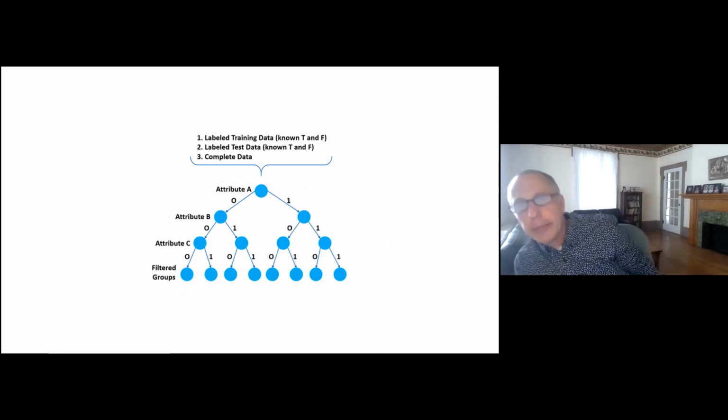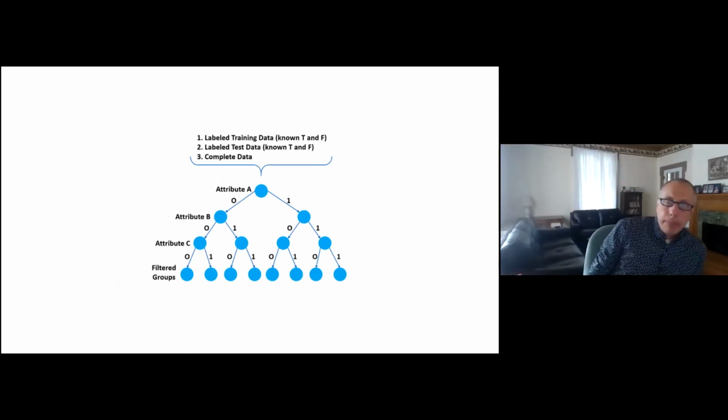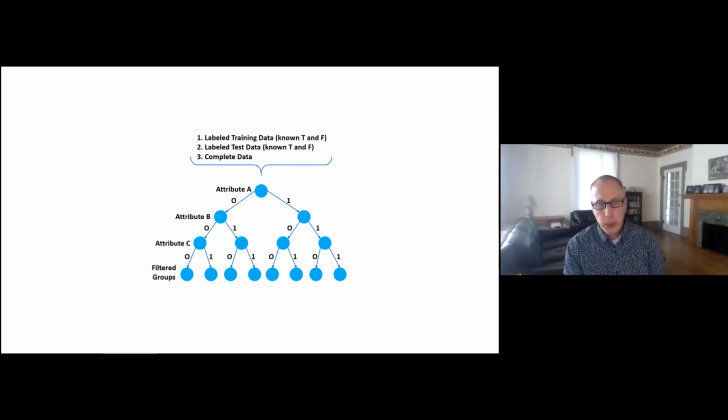We use what's called a binary decision tree, and here it's still a supervised training exercise. Basically, we're providing the results to the machine, and we're saying these certain results were true and these certain results are false. Then we're training on a subset of the data and applying it to the remaining set, such that we never train and test on an overlapping set. And we do this multiple times.